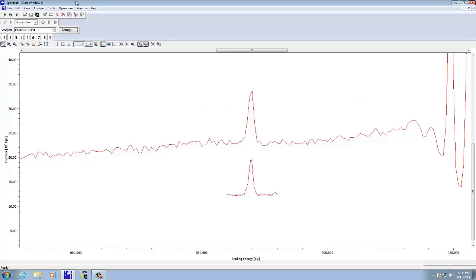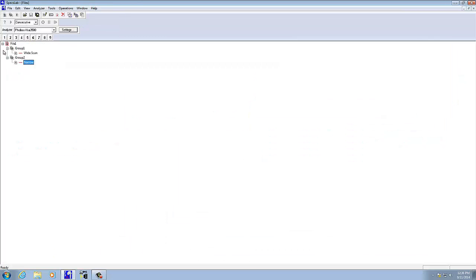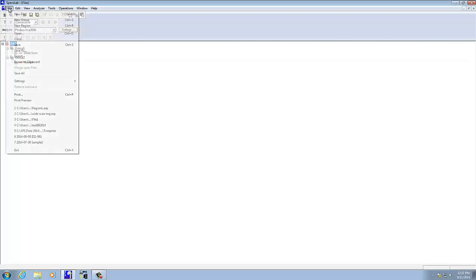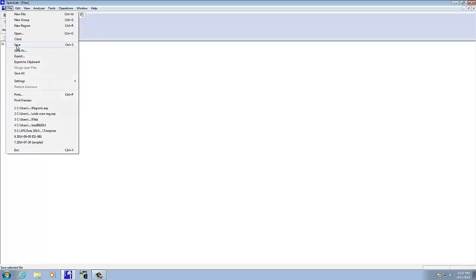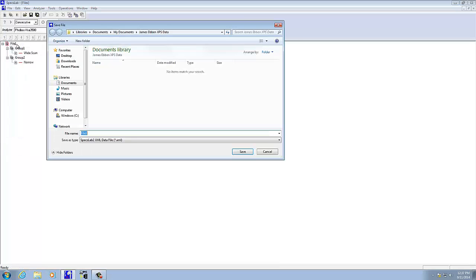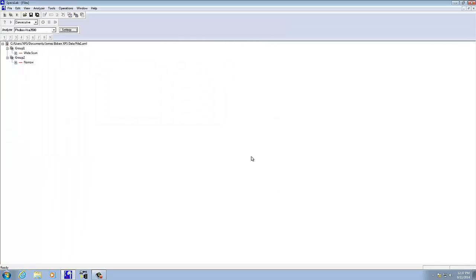That scan's done. If we go to files again, now we see there's two different groups here. If I wanted to export it, I'd have to actually highlight file here, if I want to save it, I can just save it, we'll just leave it as file 1, and there we have our data.